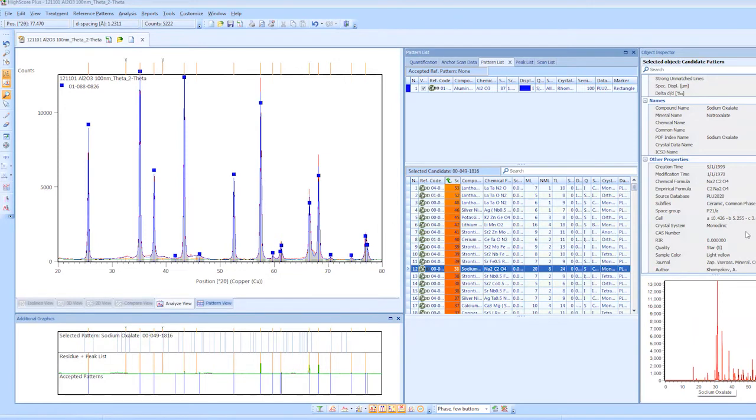This is very typical. When you start matching, monoclinic is a very low symmetry, it's not like a cubic structure, right? So you tend to have a lot of lines. So monoclinic is going to show up a lot as matching fairly well for these lines because it shows up with a lot of lines, not something that's going to be cubic where it shows up only a couple, or hexagonal or something. So just be careful when you're going through this that you don't see a really good match with this monoclinic. You want to make sure it's there.